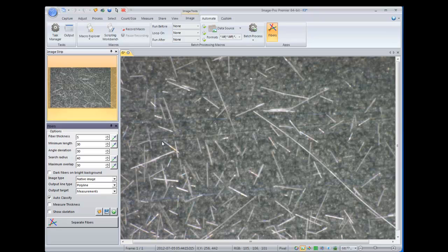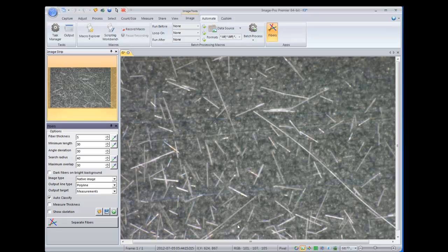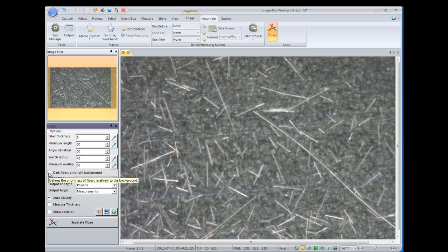So in this example, we can see the endpoints for most of these fibers. Some fall off the image, but in most cases we can see both the starting and ending point. And in this image, we have light fibers on a dark background. If you had dark fibers on a bright background, you could check this box to properly analyze that type of image.